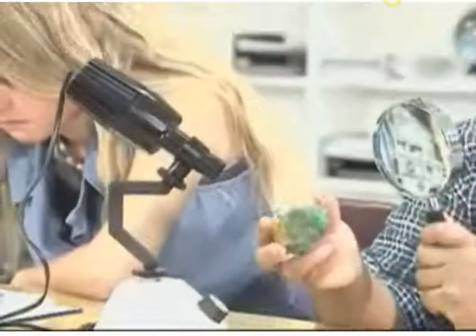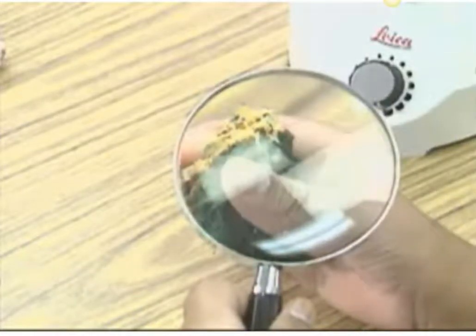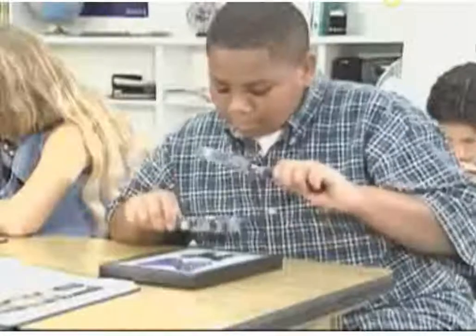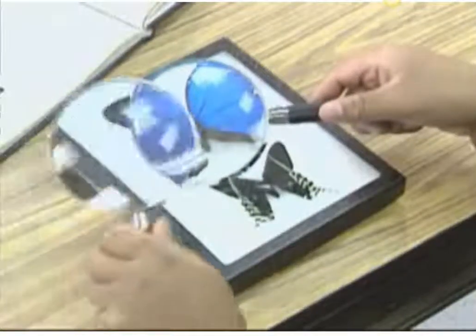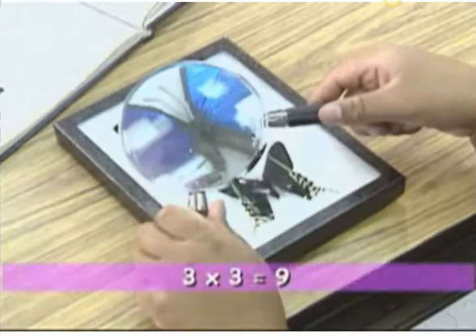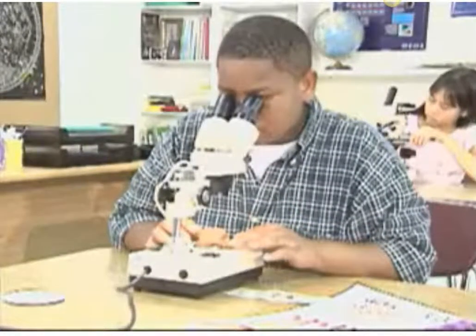Regardless of the type of magnifier you use, observation should be made in bright light for better visibility, using an illuminator when necessary for dark objects. Here's a trick. Place a second magnifier above the first, and it will increase the overall magnification. In this example, the first lens magnifies the object 3 times. The second lens magnifies that image another 3 times. The overall magnification becomes 9. That is essentially how a microscope works, combining lenses to increase magnification far beyond that of a single lens.